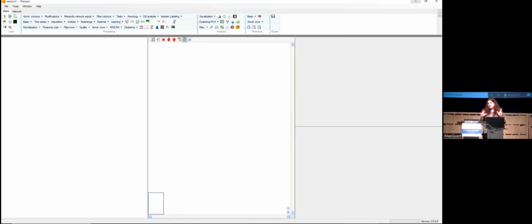So you open MaxQuant 3 times. One is without the weight normalization, one is with weight normalization with reference, and the other one with the samples as reference channel. Okay, thank you. But if you want to process in parallel, it depends on the RAM and the CPU that you have in your server, but they are 3 totally different ones.